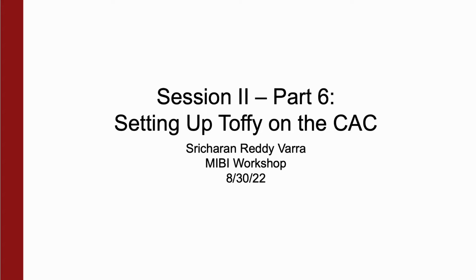Hi, I'm Shri, and today we're going to be setting up Toffy on the CAC.